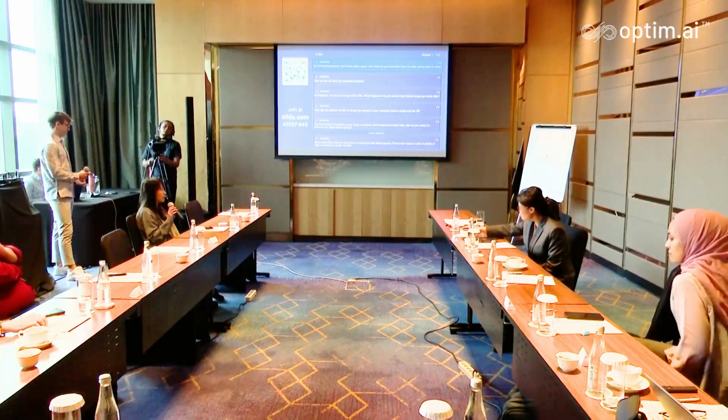Right now, for our Optim.AI test, we do short-term culture of the tumor cells. For hematological cancers, we seed, and within 24 hours, we do drug treatment. So there is no real opportunity for the cells to grow, or for them to die of too much. For solid cancers, it's a bit longer, because we want them to form 3D organoids before we do drug treatment to mimic the internal system better. But it is still short-term culture. We are not expanding or trying to grow the tumor cells from the primary tissue.